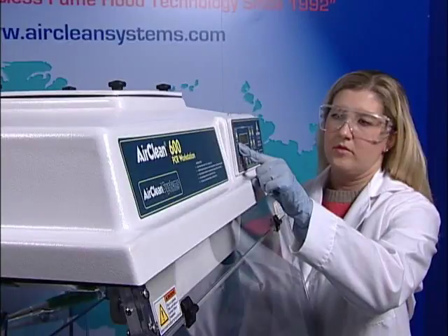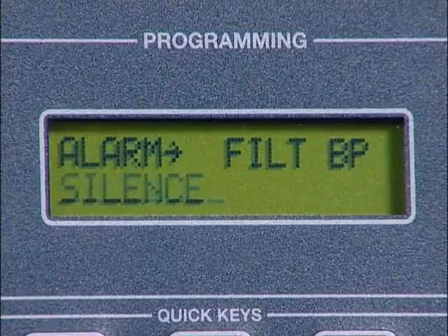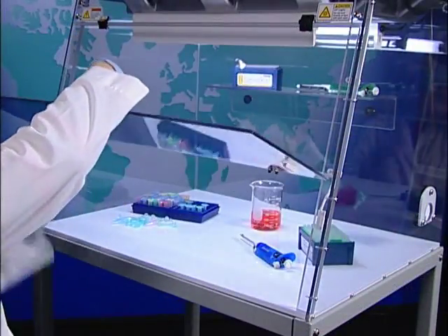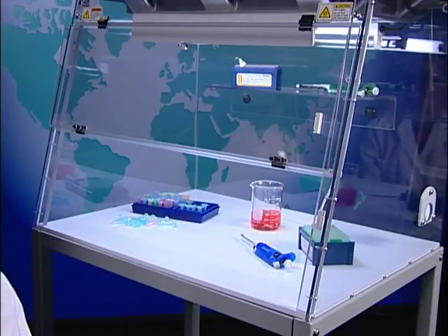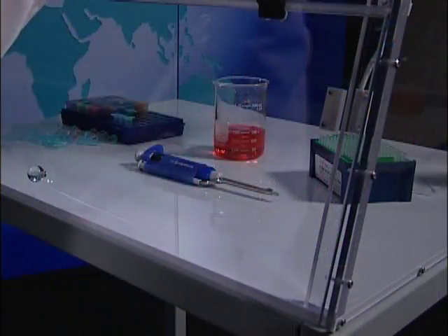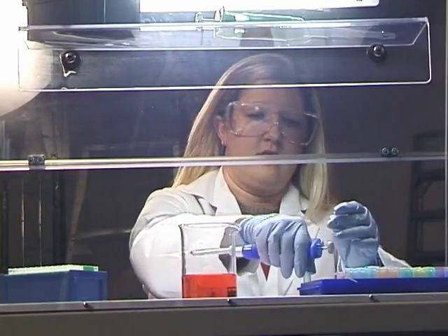The UV-tect controller is standard on the 32 and 48-inch wide combination workstations. UV-tect constantly monitors the effectiveness of the workstation, alerting the operator if the HEPA filter or UV bulb need replacement. UV-tect automatically turns the blower on and off in relation to the position of the front sash. If the sash is open, UV-tect automatically turns the fluorescent light and blower on, providing a Class 100 work environment. When the operator closes the sash, UV-tect automatically turns the blower and fluorescent light off and allows the UV light to be activated. If the sash is opened while the UV bulb is illuminated, UV-tect automatically turns the UV bulb off and turns the blower and fluorescent light back on to create the ideal work area for amplification of DNA and RNA.